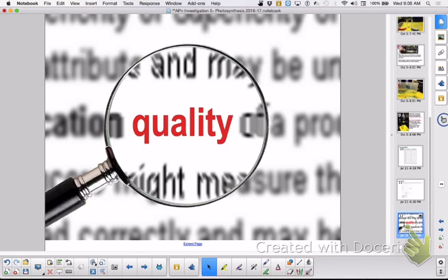I have some other setups at the lab station I want you to be aware of. You'll use these as well. This is probeware that you use with iPads. I have this set up for a fossil lab I'm going to be doing. So just don't mess with that. If you're super interested, I can show you how to do it, but you don't need it for your lab, so just ignore that aspect. Within your lab stations are everything you need.